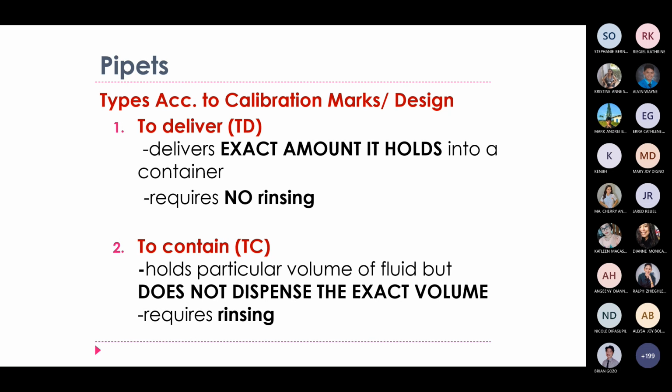What is rinsing? You might get confused because there are rinsing terms that we are going to mention later on. Say this is your pipette. Pardon the drawing. When we say rinsing, say this is the amount of solution that you have aspirated and you're going to dispense.